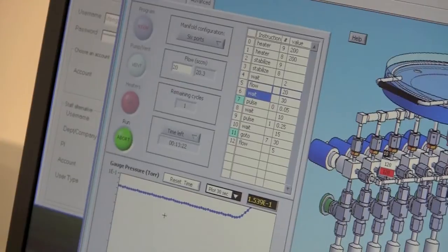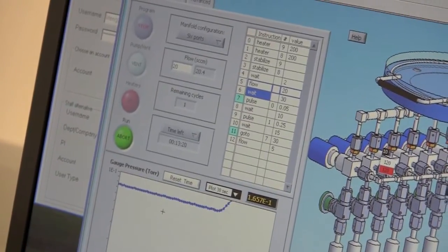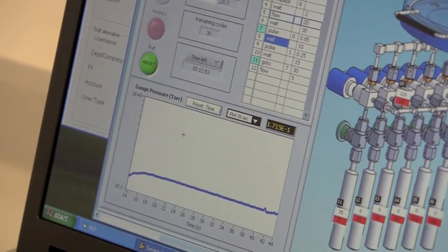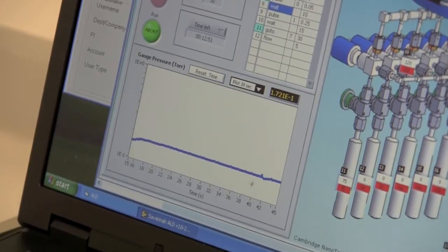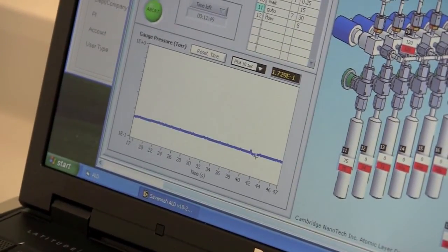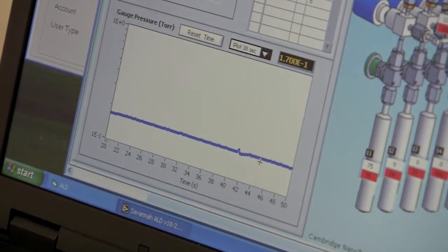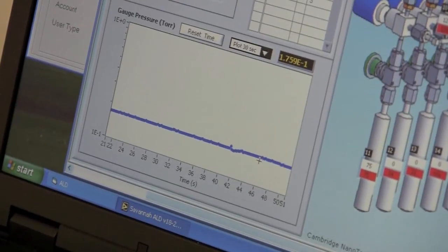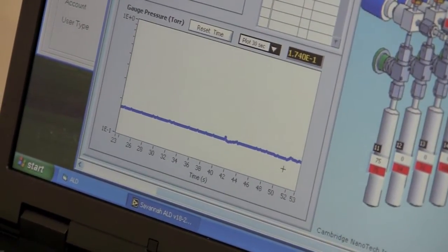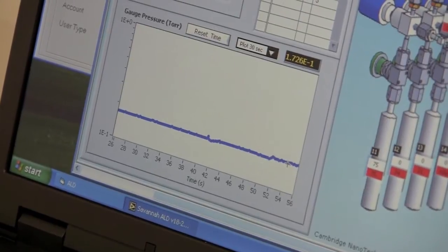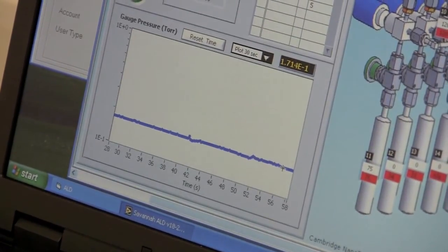Now the system is stabilizing. The stabilization is over. And you see the first pulse comes in. That means the precursor is pulse injected into the chamber. Now here's the second pulse comes in. That means the water vapor is pulse injected into the chamber.